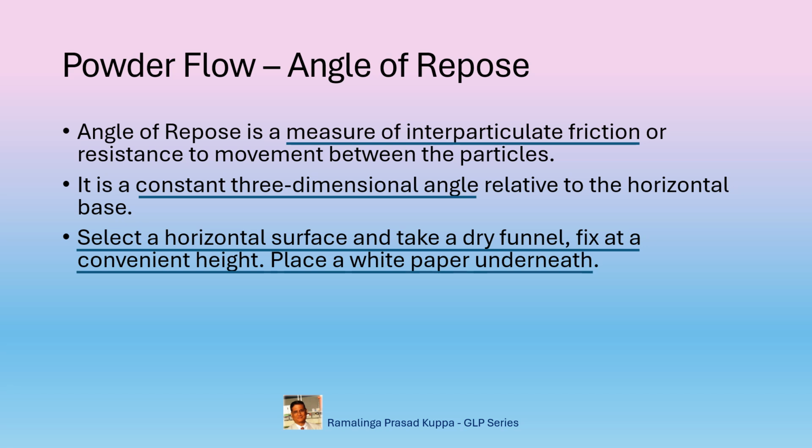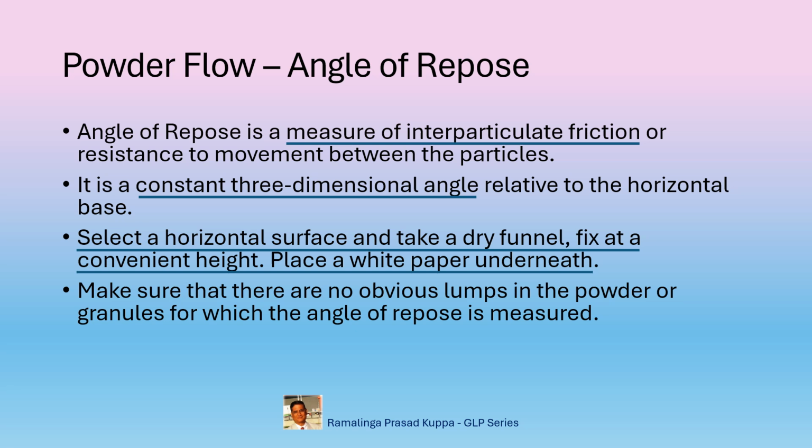White paper is to collect the powder in a pile form. The height may be varied if the pile formation is not complete at the height at which the funnel is fixed. Make sure that there are no obvious lumps in the powder or granules for which the angle of repose is measured. This is important. Do not crush the granules or powder, but make sure that there are no obvious lumps in the sample.